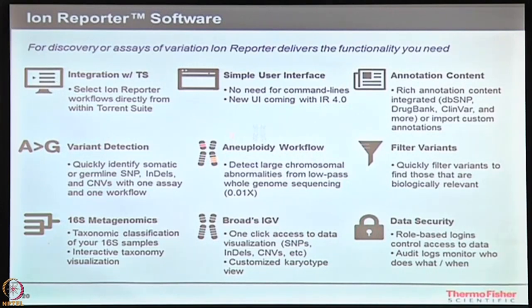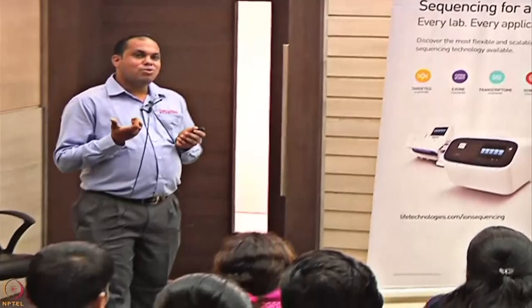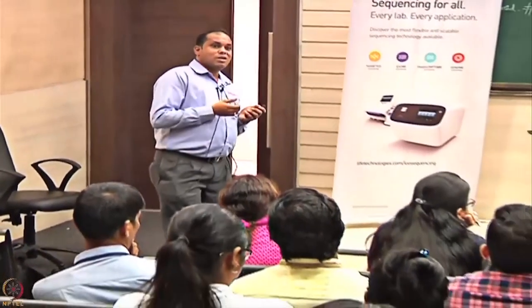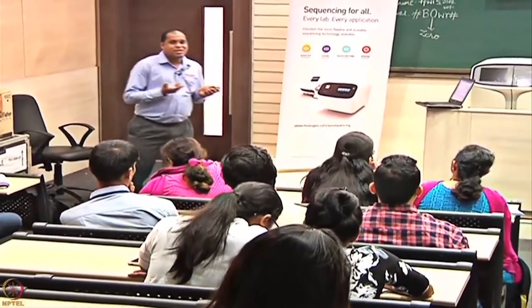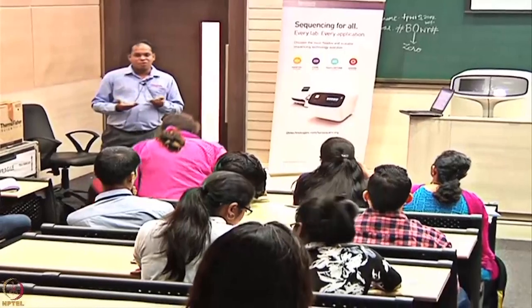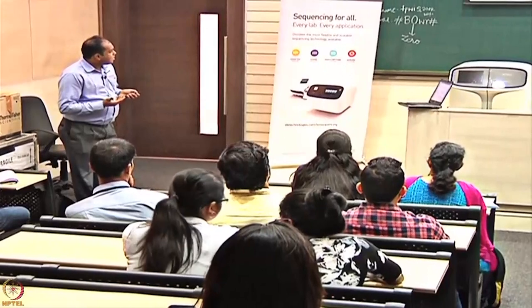As well as you have something called aneuploidy. So you like to look into large deletions, or you like to look for aneuploidies across your embryos, right? You must have heard about IVF, right? In IVF, they normally go forward with certain embryo screening, where they like to know whether there are deletions or certain duplications happening in your data or not. At that moment, this particular workflow would be very helpful for you. Okay. So not touching much on this, rather the other part of it.